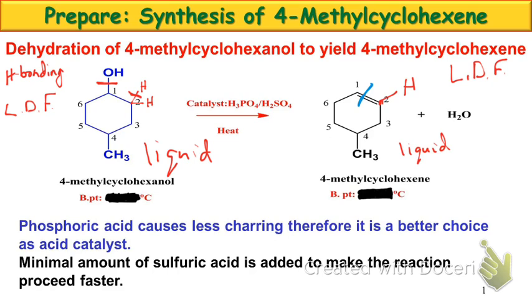Okay, so that could work. We can look at it using a distillation technique to separate these two liquids. We could try to do something more simple by doing an extraction. But if we look at our intermolecular forces, they're pretty much the same. So we wouldn't expect a huge difference in solubility. So we're going to have to rely on distillation, or a difference in boiling points.